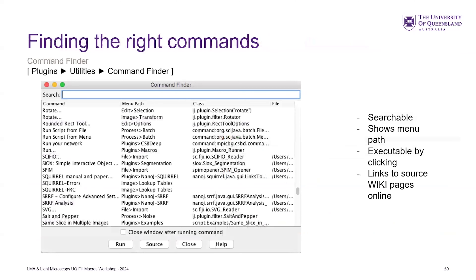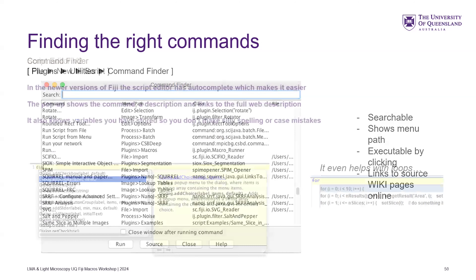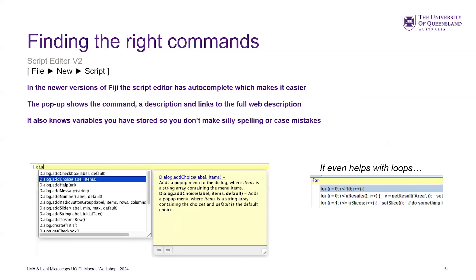Another way is there's a Command Finder — or Find Commands, as it's called on the new Mac version — where you can type in and search to find stuff. This is probably a little bit obsolete now that autocomplete in the IDE is there. So if you've got a new version of Fiji, you'll see that as you start typing it autocompletes and gives you a nice little text example. If you click the hyperlink it'll take you to the full web documentation, which is scraping the same thing and shows you all the commands.